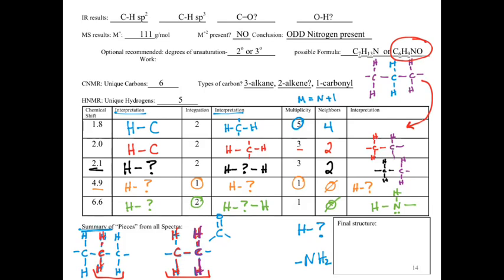If we go through and do that, what's our result? Well, now we don't invalidate anything. Okay? What this means is that it's not just a duplication of our hydrogens, we actually duplicated our carbons as well. So what I can now do is again simplify my overall structures, and if I was writing this out in pencil I would then cross out my other one, but since I've got a digital pad I can erase this, and this now makes a little bit more sense, maybe.